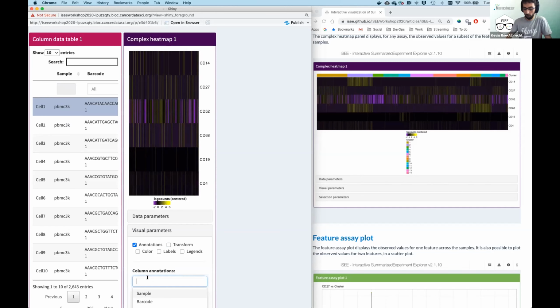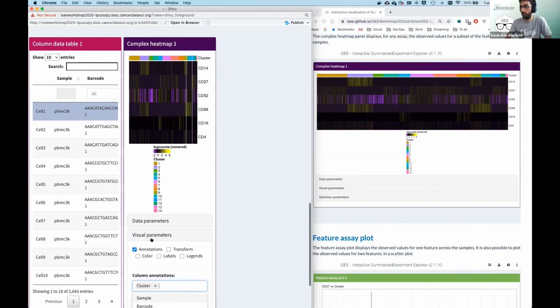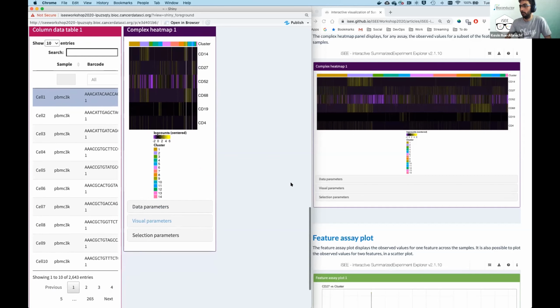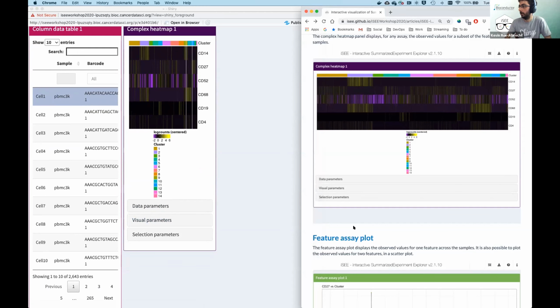For the column annotation, we've grouped our cells by clusters, which is down here. And once I start typing that, then we start having this blob of yellow here and there. So yeah, you can do that. You have a lot of different features that would take hours to go through in their entirety. I'm going to speed up a bit so I can hand over to the others.